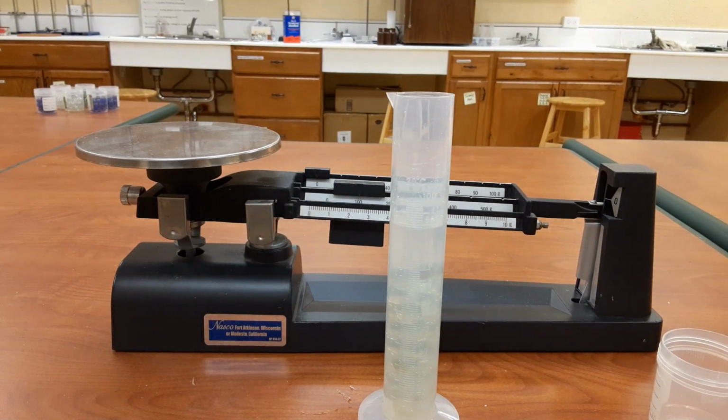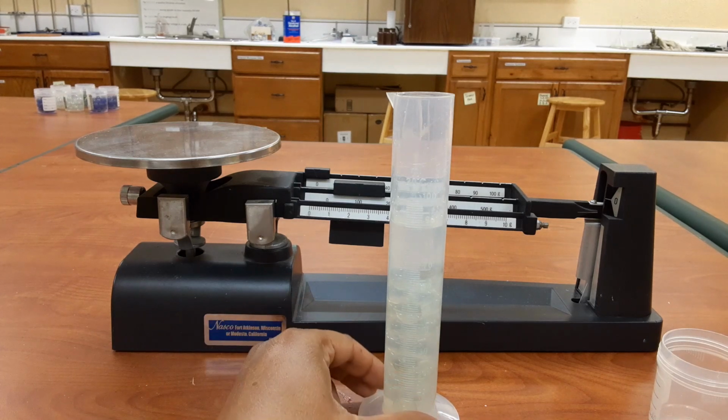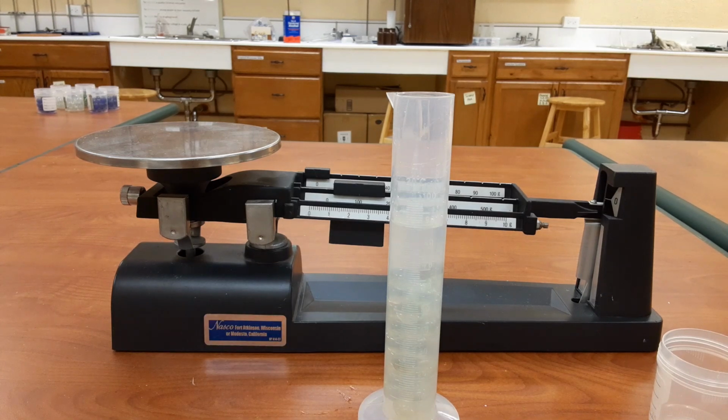So I've put all of those marbles into the graduated cylinder, and now the new volume I have is 88 ml or 88 centimeter cube. So what is the volume of those marbles? It would be 88 minus 54. So new volume minus the old volume.